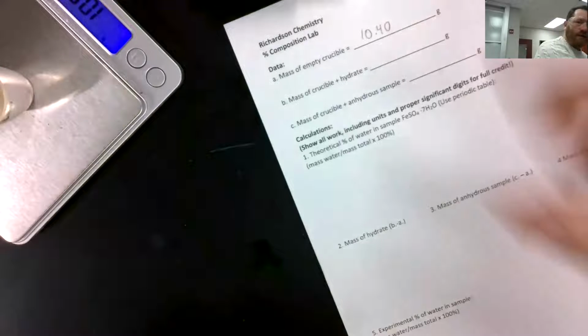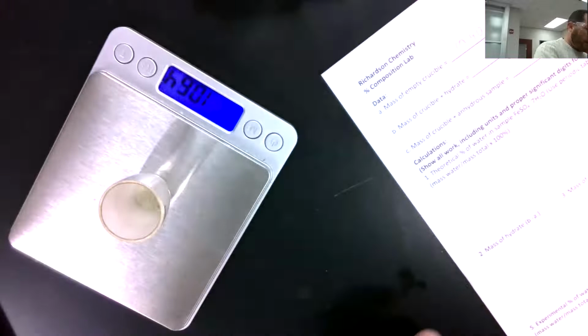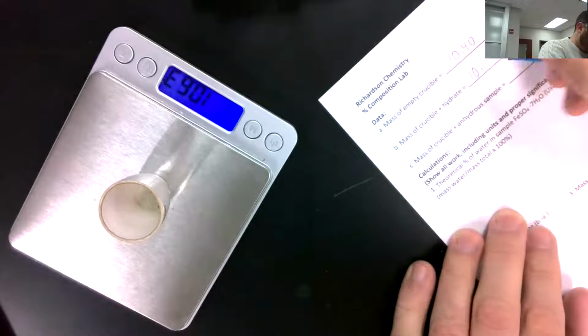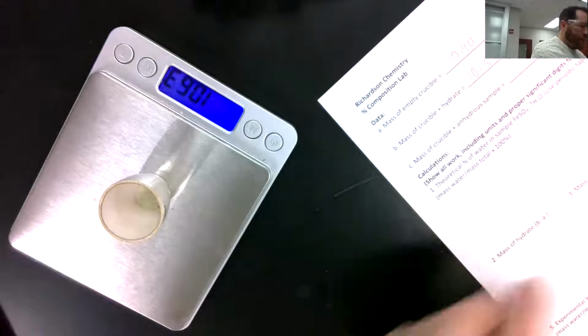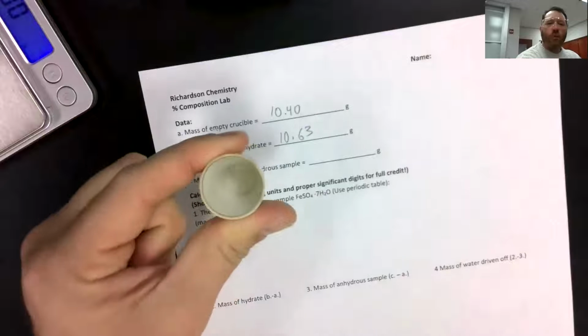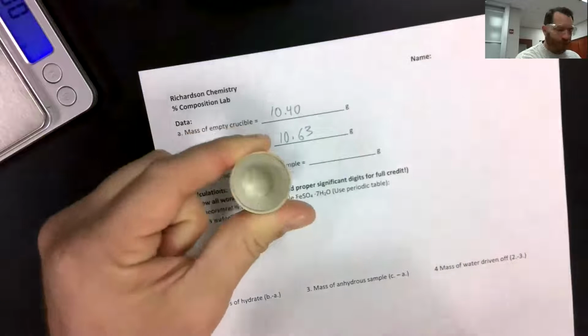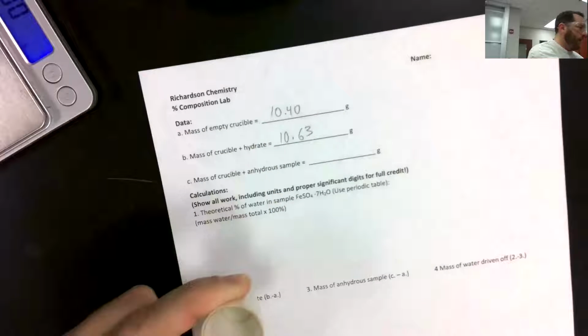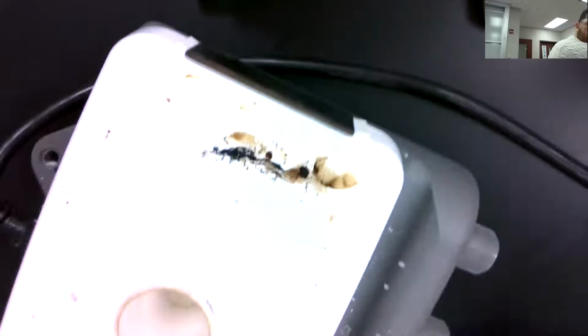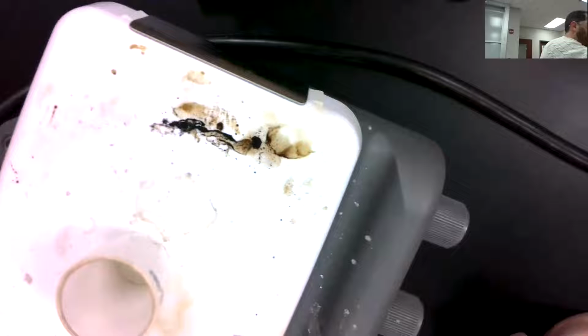So throw that back on the scale, see what we get. 10.63. All right, so the next step is we're going to figure out the percent of water that is trapped in there. How are we going to do that? Well, we're going to set our crucible with salt in it onto a hot plate. Already got it going, so it shouldn't take too long.